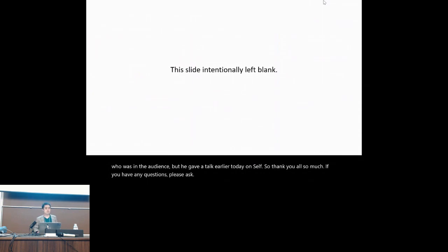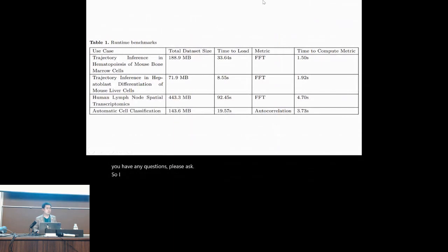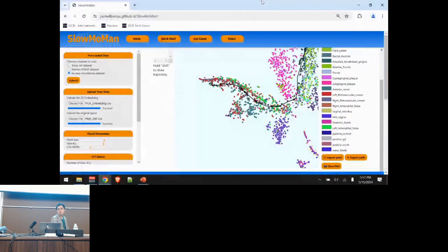So I have a question, maybe two. One, I see that there's line width. Does that just change which cells, like, around, or which pixels? No, this is purely visual. So basically, right now our proxy is at every point along the line. We just choose the nearest real point.